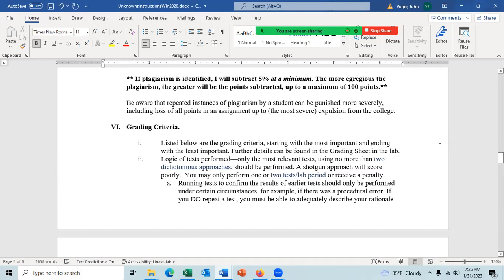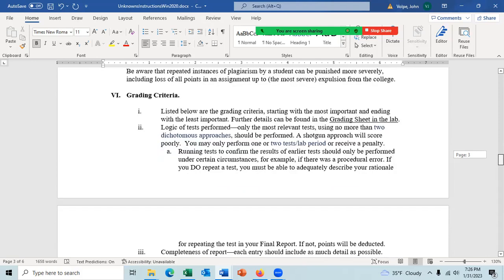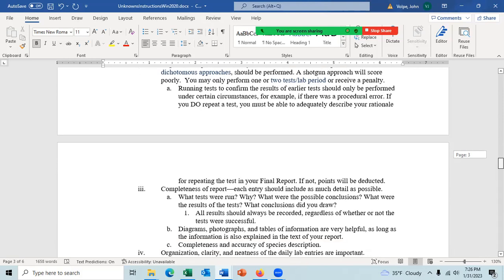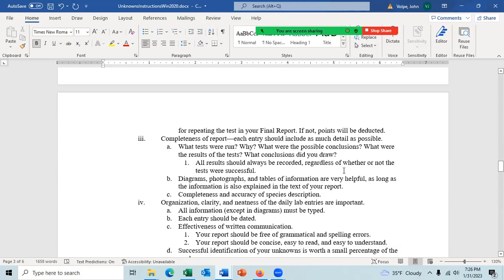The grading criteria, let me talk about that. You will be graded on dichotomous logic. You should have the completeness of the test, what tests were run, why you ran those tests, what the possible conclusions were, meaning what species were under consideration and what the test would show, and what conclusions you drew from the test.